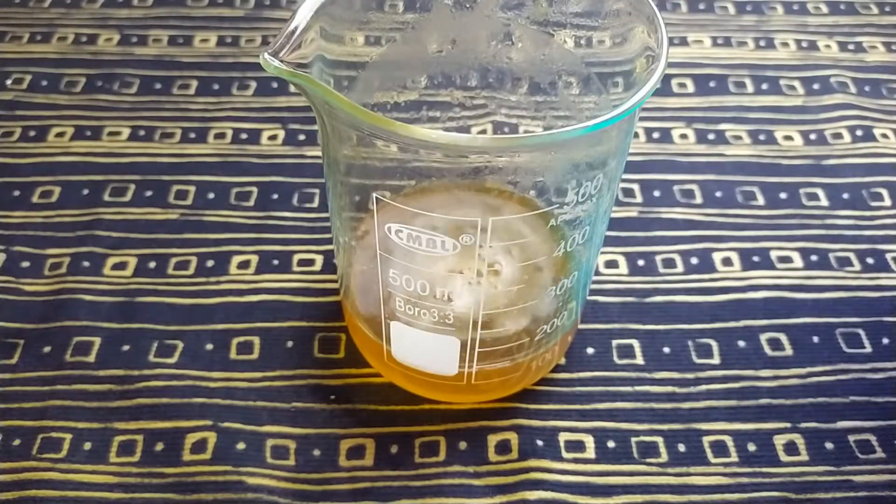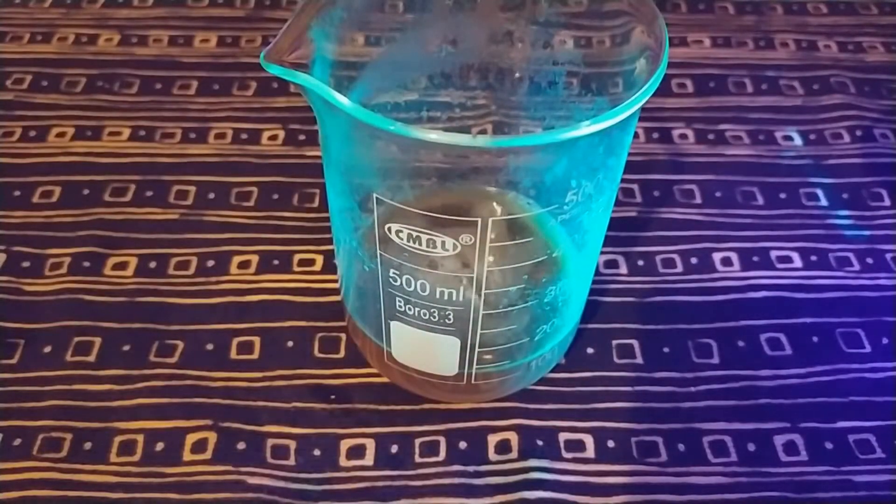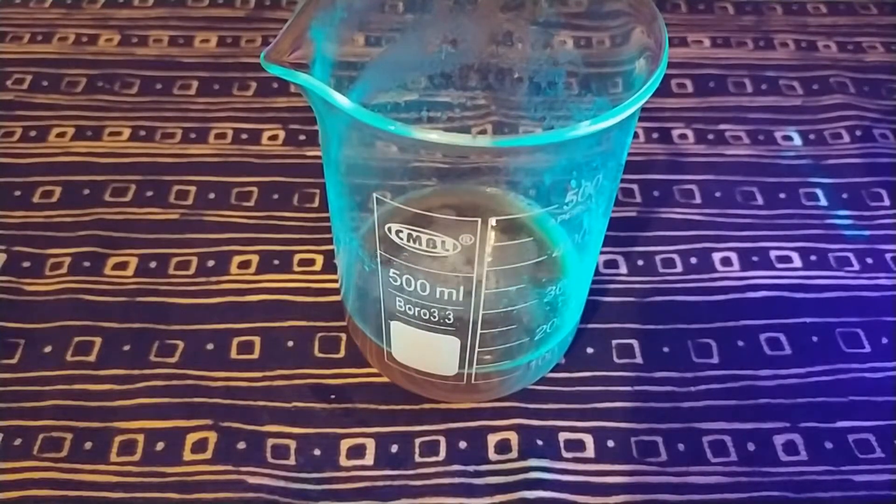Harmaline free base is almost insoluble in water. Upon addition of acid it turns to the corresponding salt — in our case acetic acid was added, so in solution we can see harmaline acetates, which strongly glow under black light.